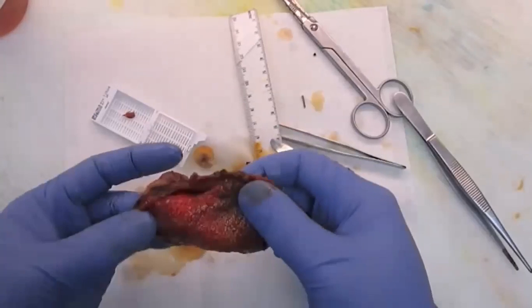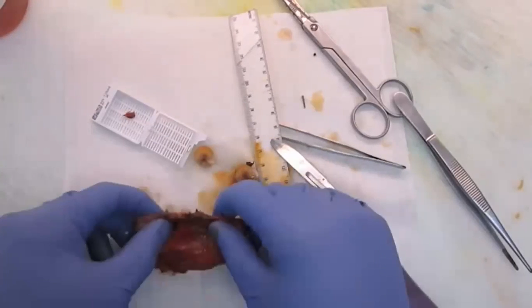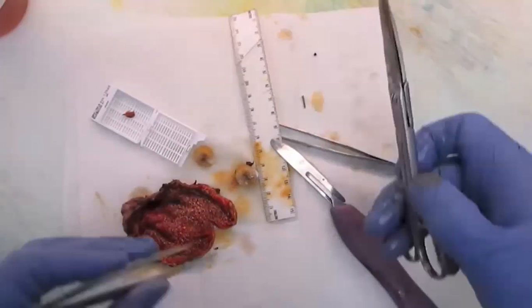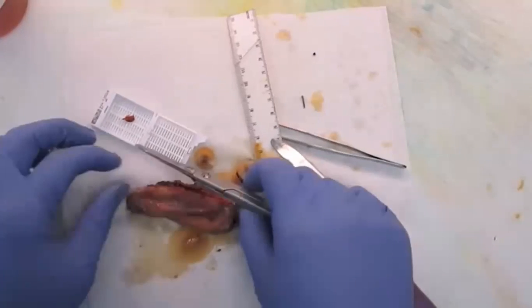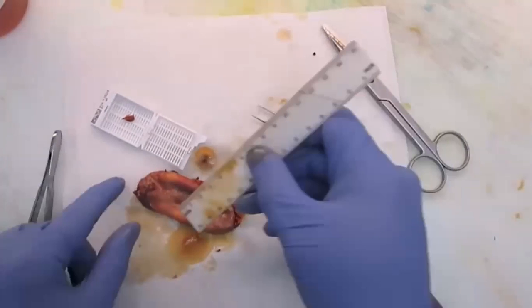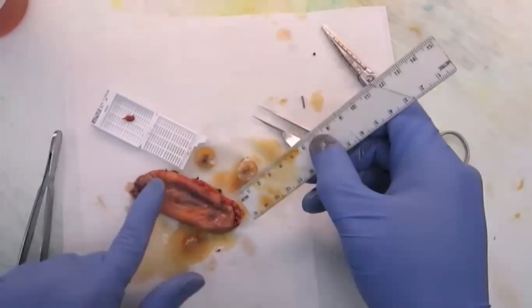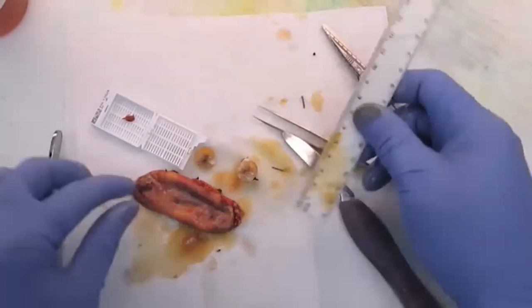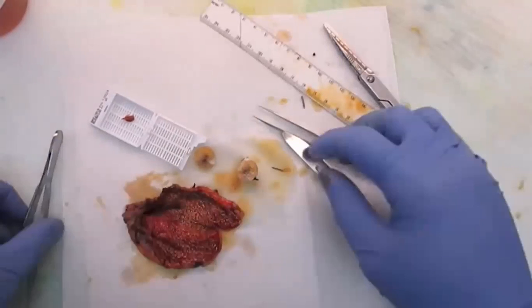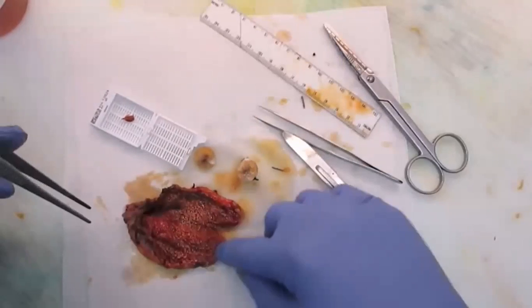Representative sections are submitted in cassette A1. So even yung abnormal structure described, no? Since there are 3 areas anatomically of the gallbladder, you have to get a representative sample from the organ. And so we don't want to sample the same area again and again. You must choose the most abnormal part.